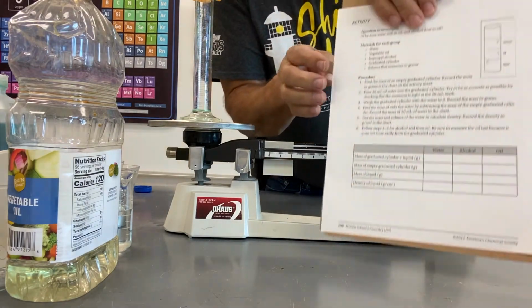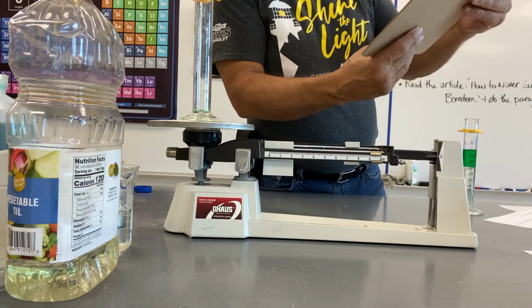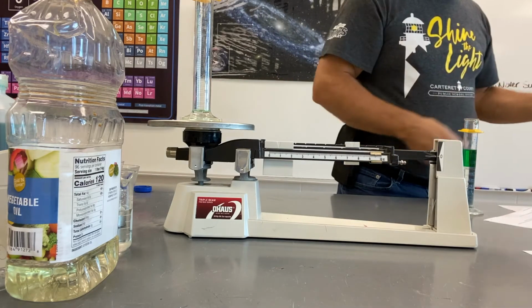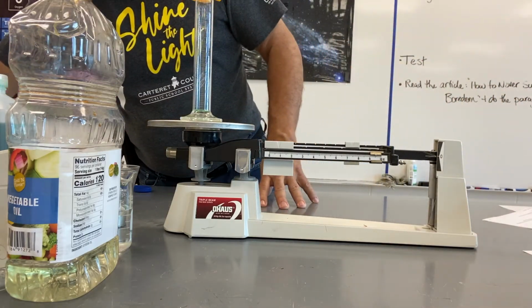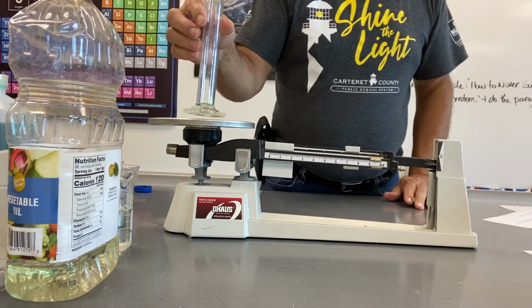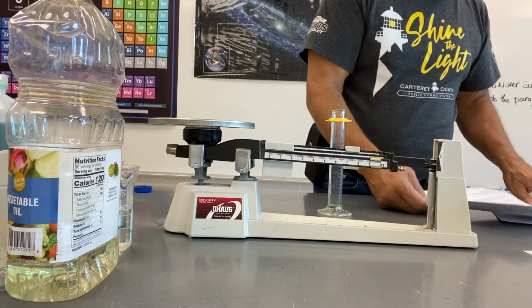So again, that is down here on our activity sheet, the table down here, this is what we're going to be filling out. So mass of the empty graduated cylinder, we need to write that down. Moving on now. Dump out some liquids here out of my graduated cylinder. All right, so we're keeping that measurement because we're going to need to be subtracting that measurement.